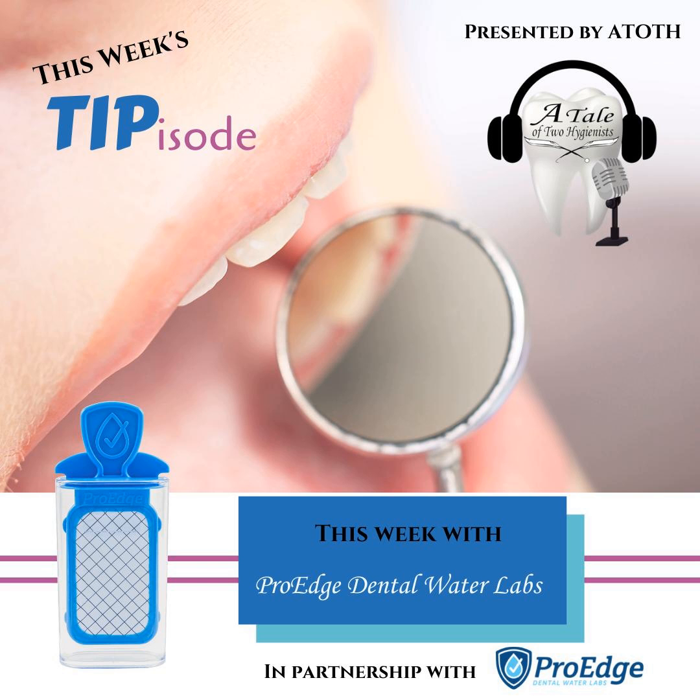Now, the trick is that you want to make sure that the samples you take from all the devices in Op1 are the same size samples. So, for example, in Op1, you might have 2 air water syringes and 2 high-speed handpiece lines, doctor side and assistant side. As long as those samples are of equal size, you can take 4 samples, put them into one vial, and test that water. If you pass, you've proven, and the data, Mr. Devil's Advocate, the data proves that all 4 of those lines passed.